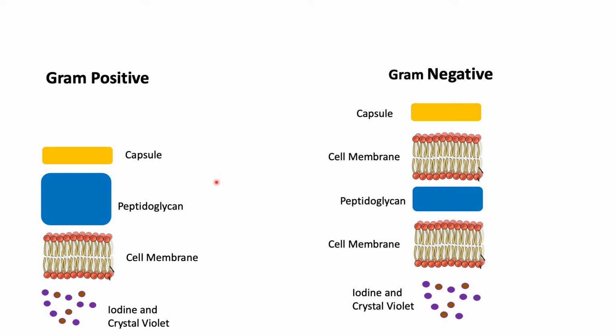So next, we apply an alcohol wash, and we know that alcohol has dehydrative properties, especially if there is water present. So when we add in the alcohol, so let's denote the alcohol with green. We add in the alcohol in both.